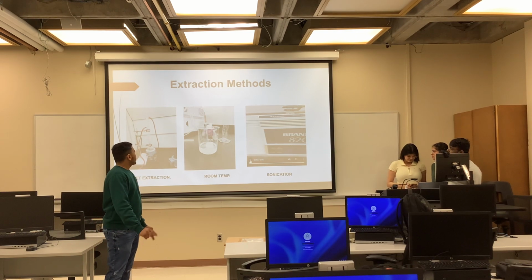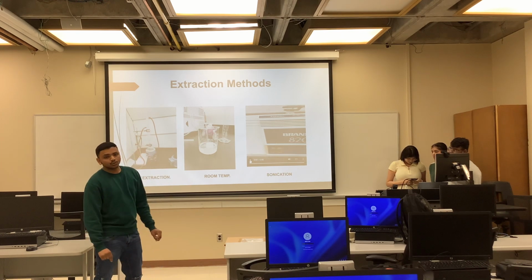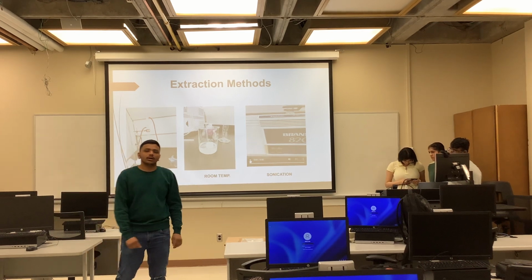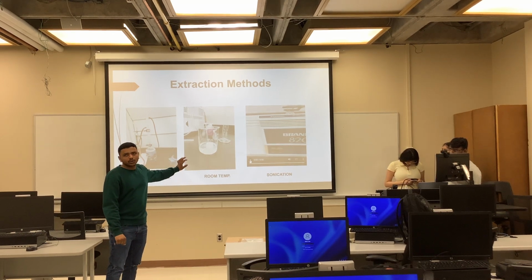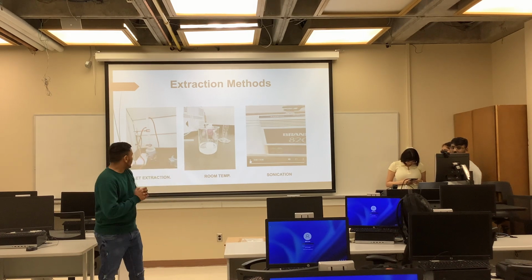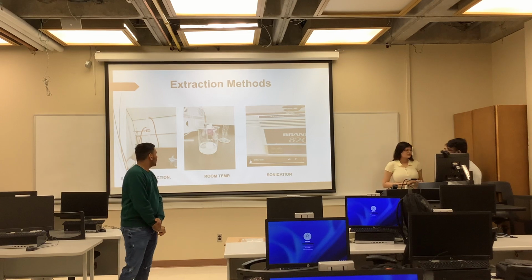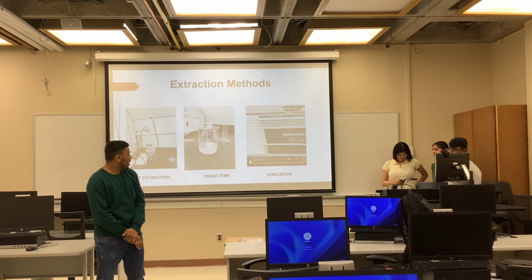But for the first 2 weeks we did the practical and it wasn't that useful because we didn't get any yield. So we took help from Birendra Adhikari. He told us to use a ratio of 1 gram to 6 ml. So we did 20 gram with a 1 to 6 ratio, and it was quite helpful for us and we got more yield compared to the previous one.